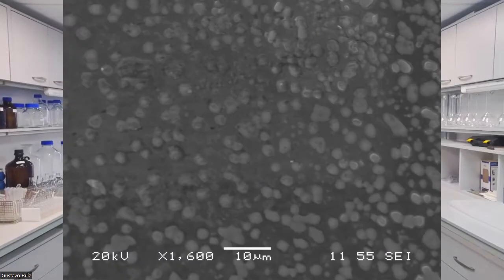So in figure 1, I show you the scanning electron microscopy images of the chitosan nanoparticles. These nanoparticles exhibit a spherical shape with a mean size around 221.4 nanometers and a polydispersity index of 0.45.